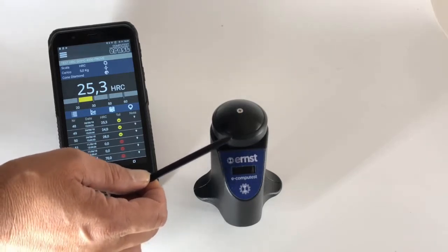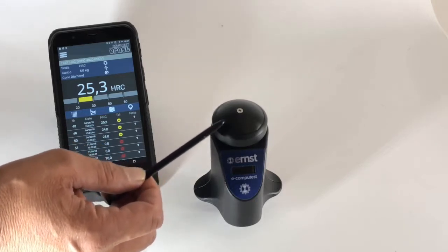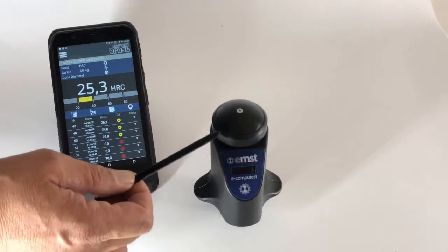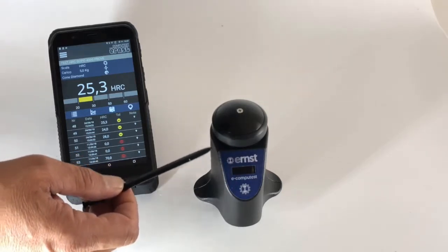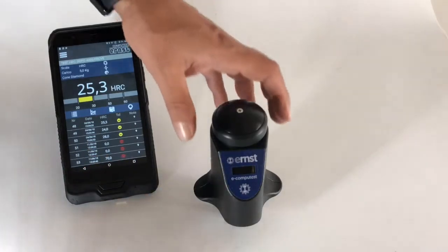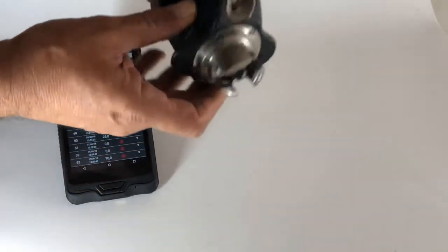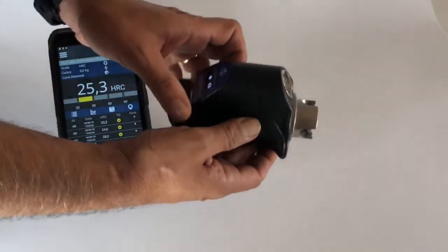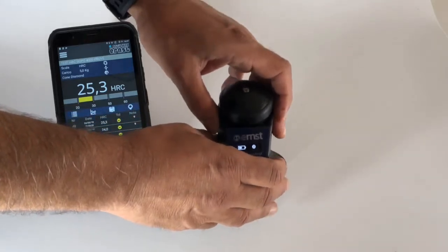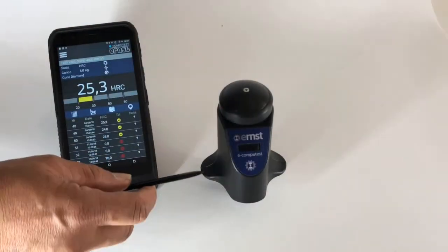It can measure samples less than one millimeter in thickness. An important feature for a portable unit like this is that you can test and measure in all directions — upside down, sideways, any direction. So there is no problem even if you have difficult samples or difficult-to-reach areas.